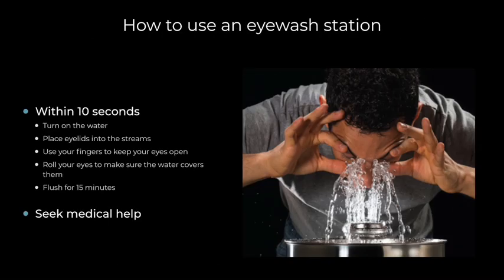In the event of chemical splash to the eyes, it is important to use an eye wash station immediately. Within 10 seconds of the splash, turn on the water and place eyelids under the streams.